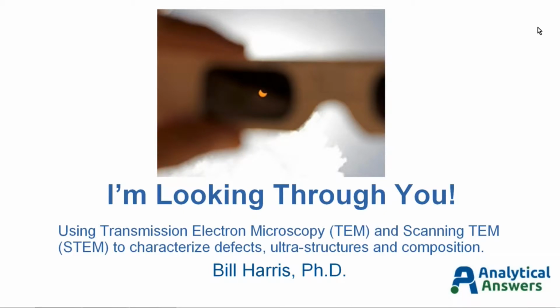So with that, I'd like to hand it over to Bill Harris, PhD, who's going to be sharing more information with you about transmission electron microscopy and scanning TEM, and how it can characterize defects, ultrastructures, and composition. Take it away, Bill.